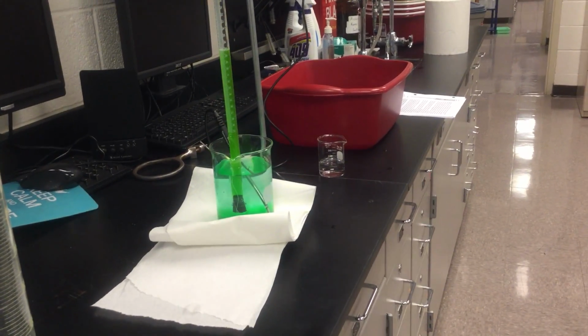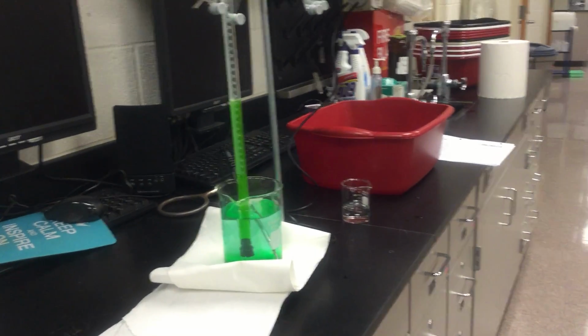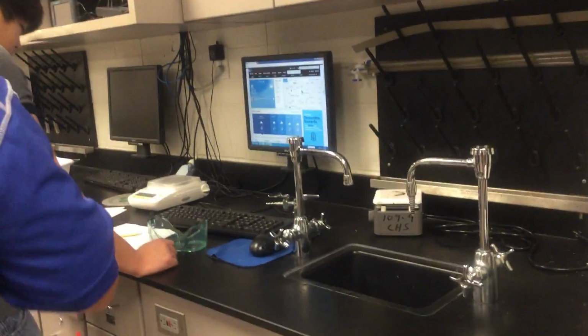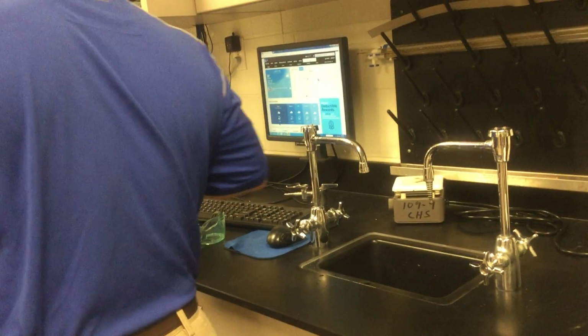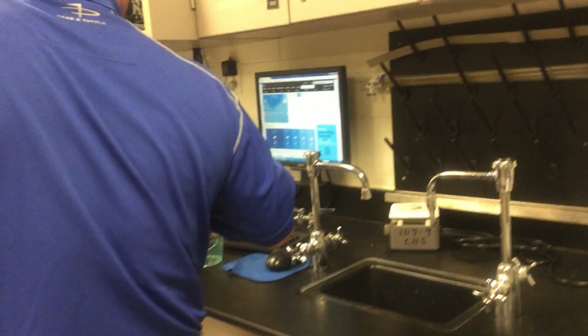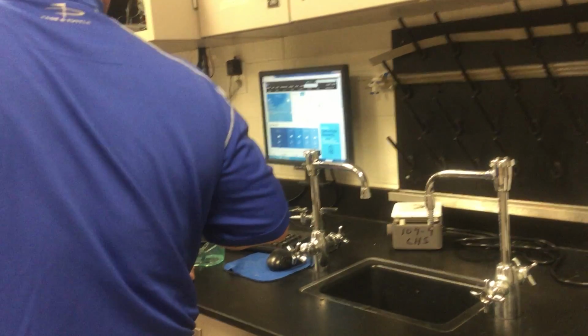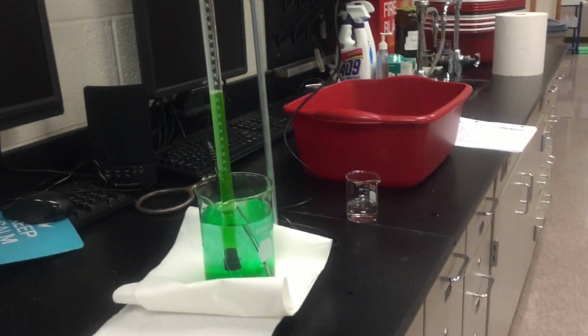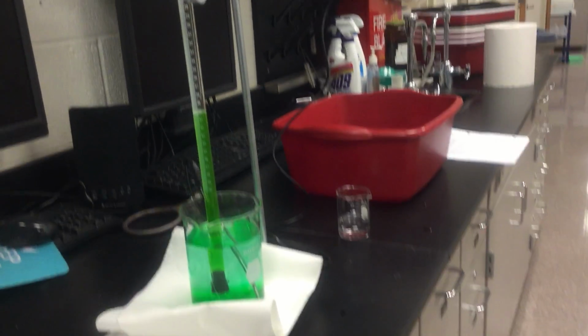Now, let's go back over here to where Sean is. Sean, would you put in there, is this on Seatown? Okay. All right, now, do not put this into the barometric pressure one, the ambient pressure. Okay, do not put this there, but make a note that right now the weather channel is reading 30.08 inches of mercury.